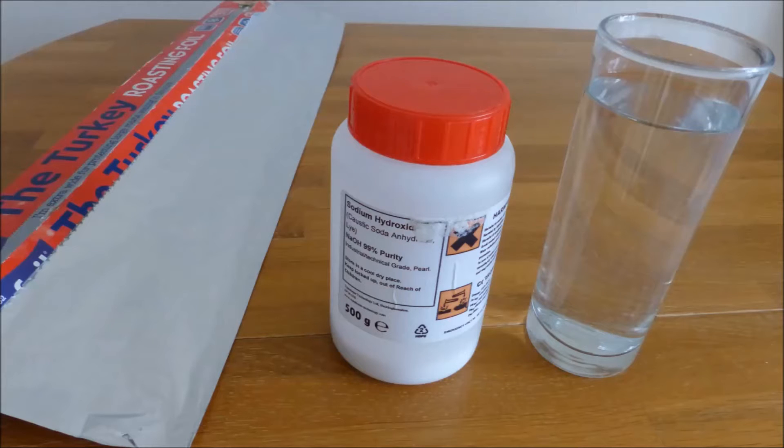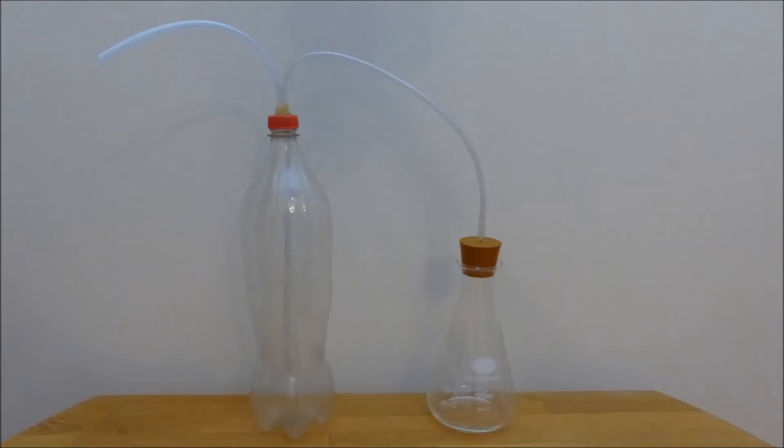To make the hydrogen we're going to use aluminium, sodium hydroxide or lye, and water. Some six millimeter or quarter inch tubing, a large soda bottle, and a heat proof flask with a rubber stopper.